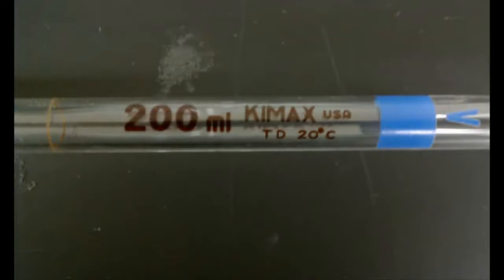Each piece of volumetric glassware is marked with its total volume, the notation TD or TC, and a temperature, usually 20 degrees Celsius. The marked temperature indicates the temperature at which the apparatus was calibrated. The notations TD and TC stand for the phrases to deliver and to contain, respectively. The TD notation, used on burettes and pipettes, means that the apparatus is calibrated to accurately deliver or transfer the stated volume to another container.